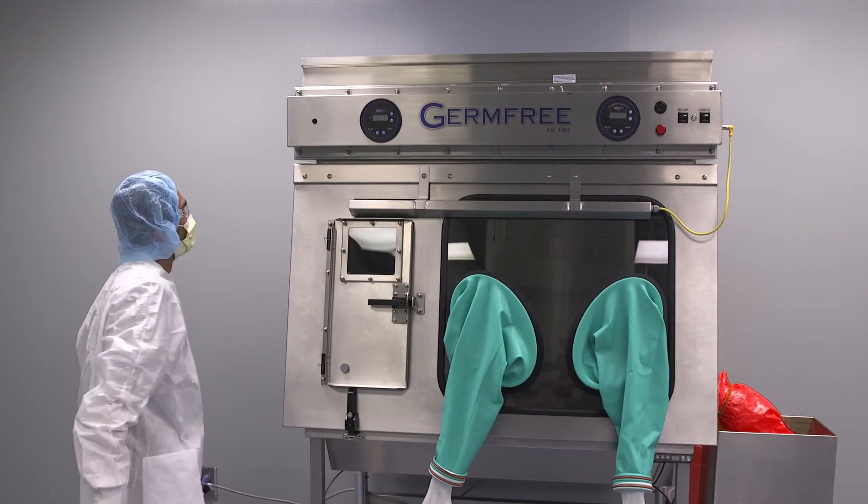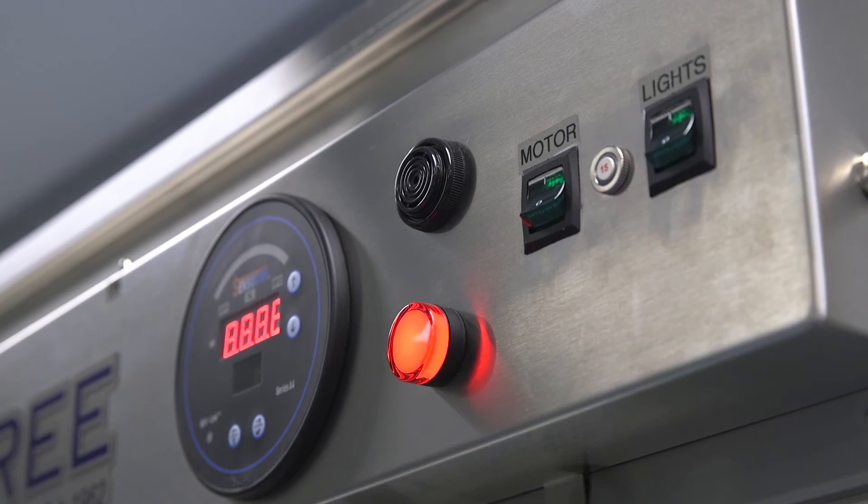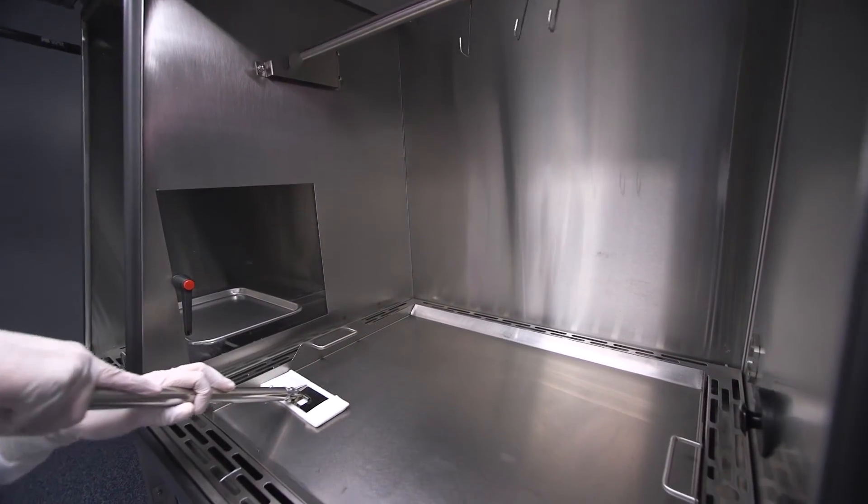Once your Versaflow has been certified, it's ready for operation. GermFree recommends familiarizing your staff with how to operate and clean this equipment before compounding preparations for patient use.